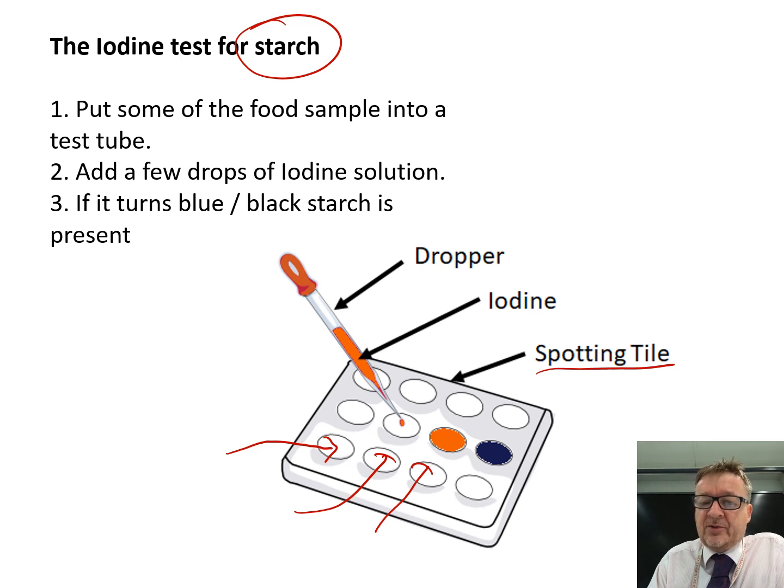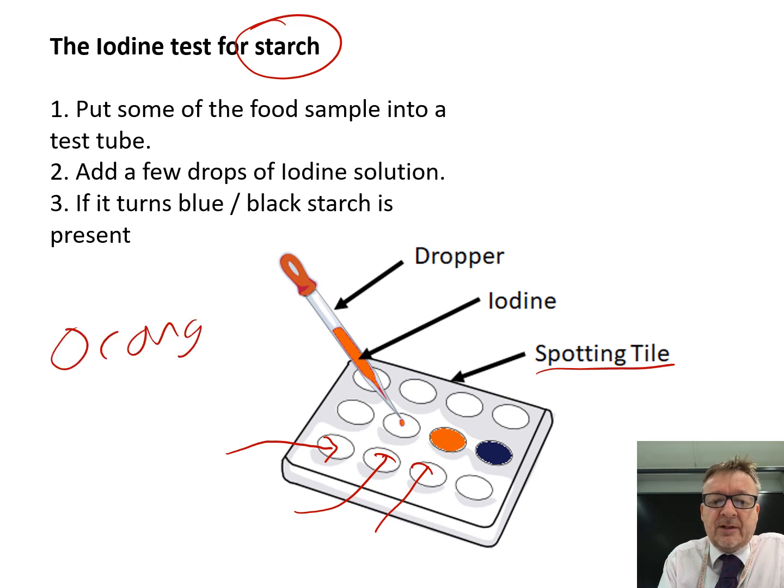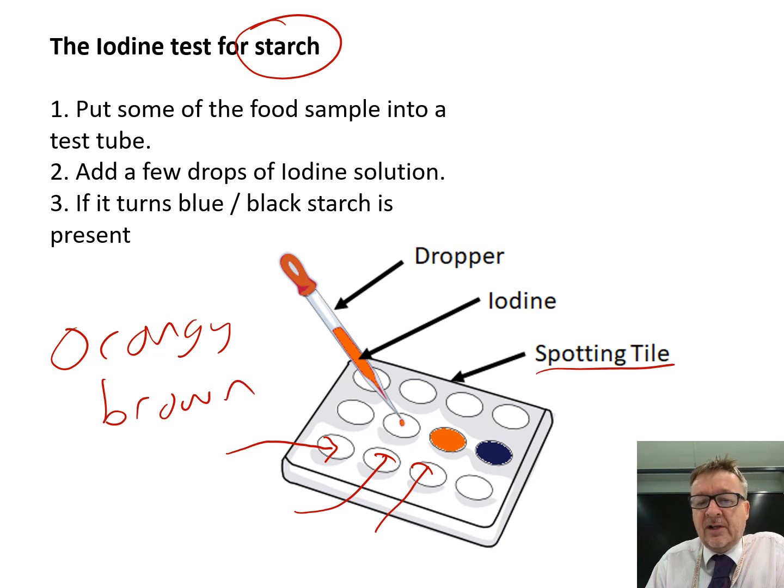Add a couple of drops of iodine. Iodine is an orangey-brown colour when it first starts off. If there is starch present, it goes blue-black. Now it always looks black to me, but if the syllabus says blue-black, you write down blue-black. And if it does go blue-black, then there is obviously starch present.